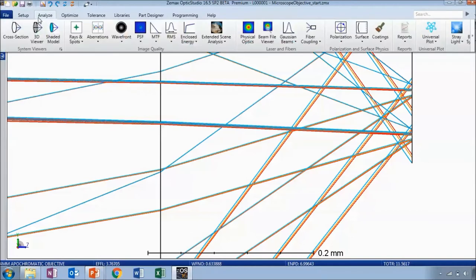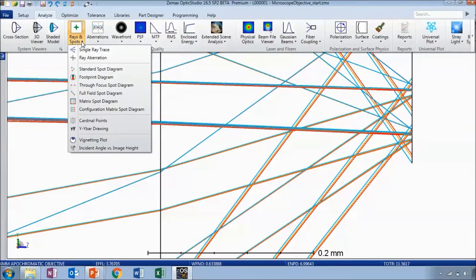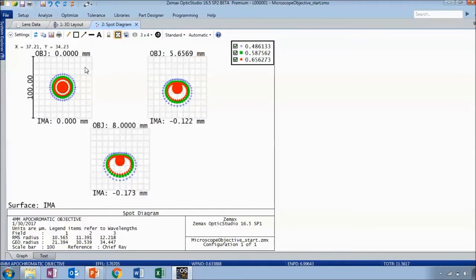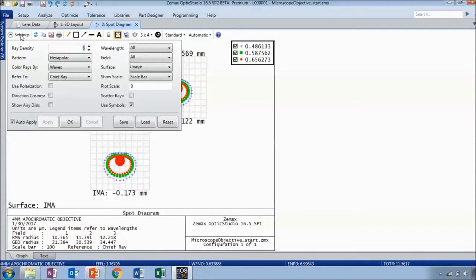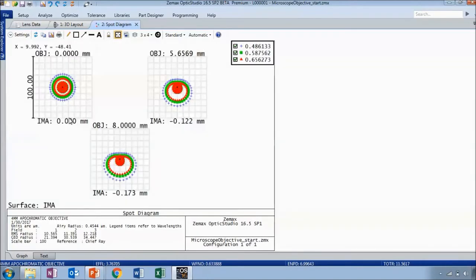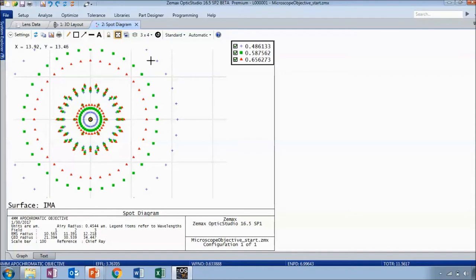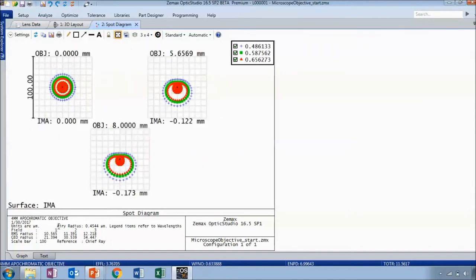Let's open up some other analyses and see what we have right now. Let's start with the standard spot diagram. I'm going to expand the settings and turn on Show Airy Disk. You can see the system is far from diffraction limited — the Airy disk is really small right in the middle. You can also see the Airy radius in the text section compared to the RMS and geometric radii for each of your field positions.